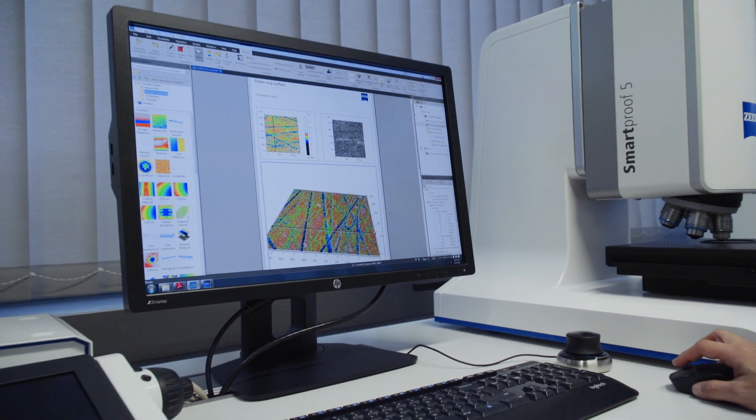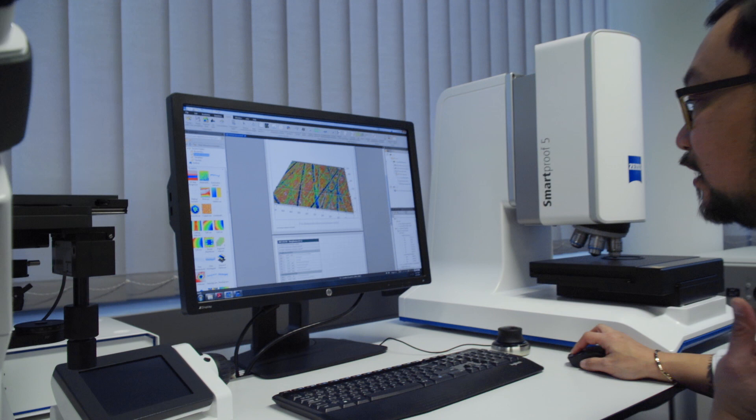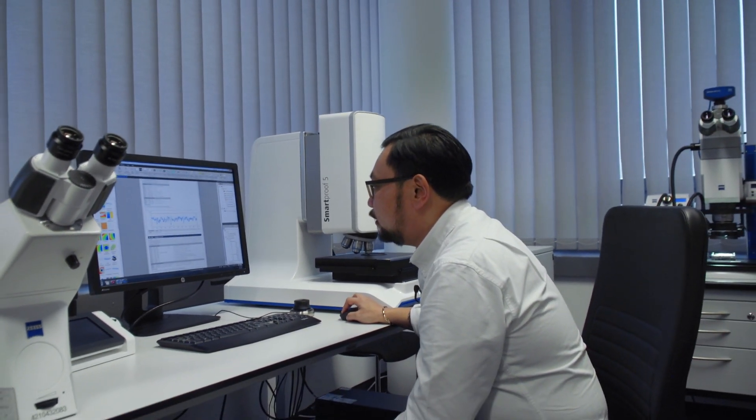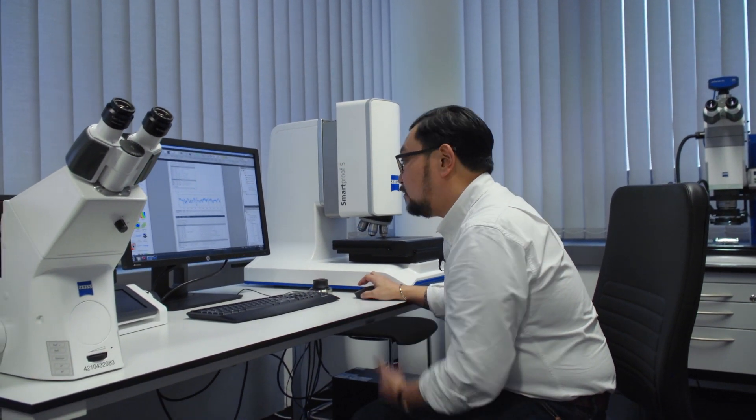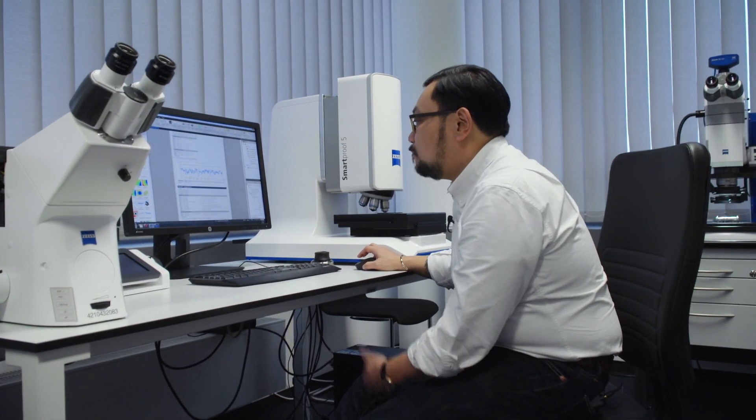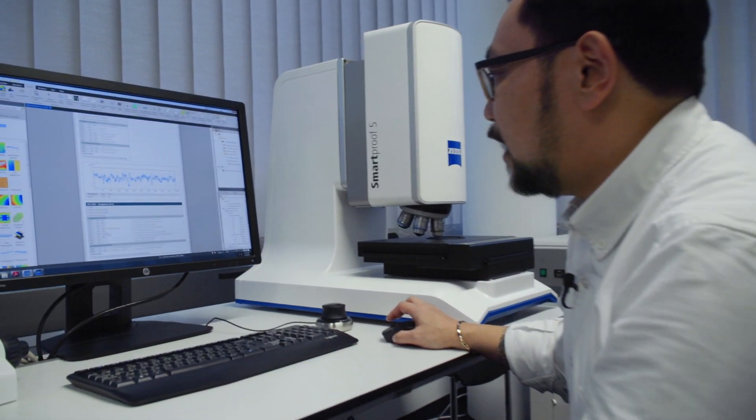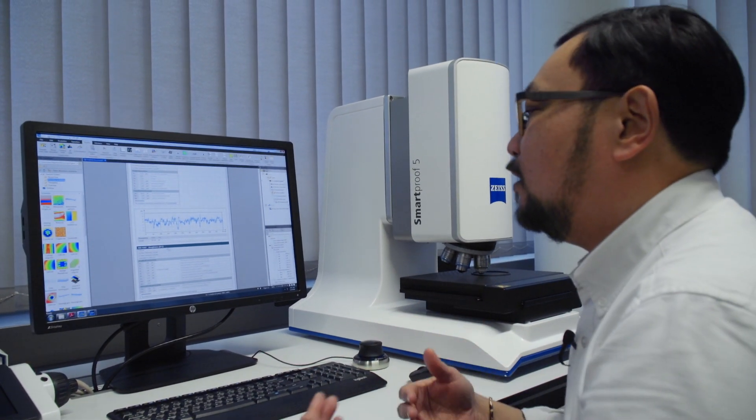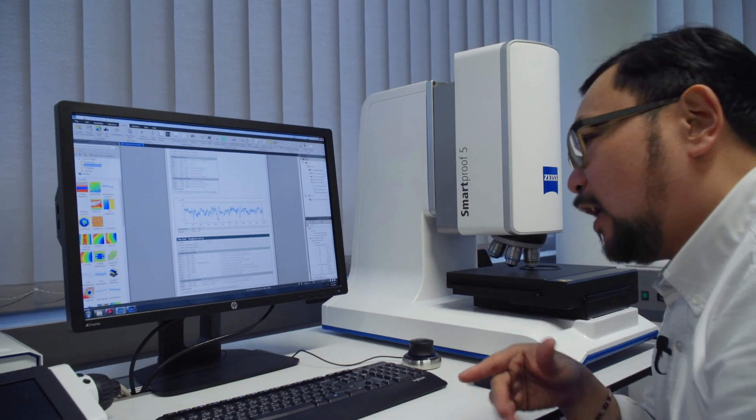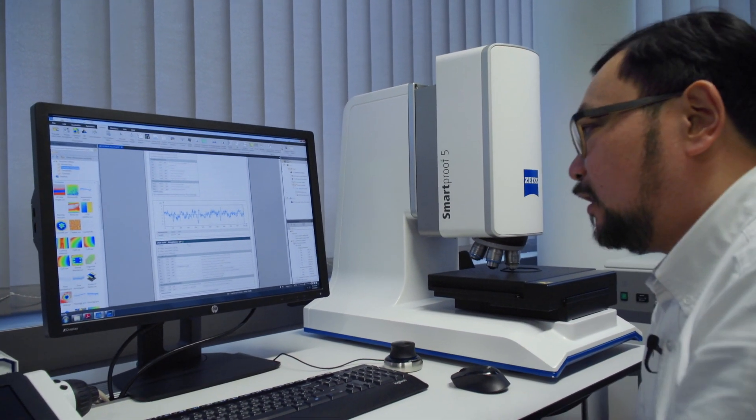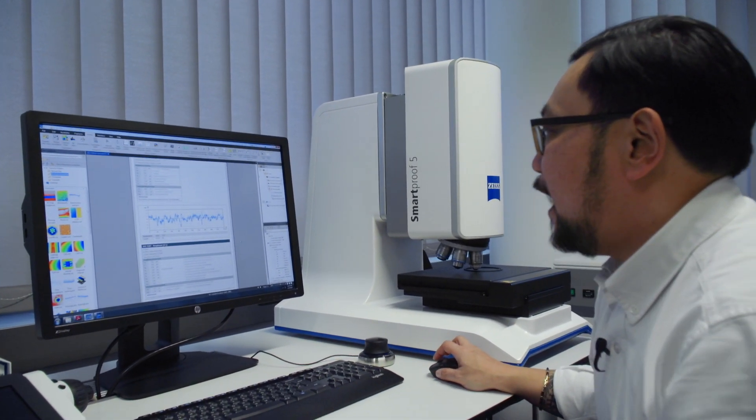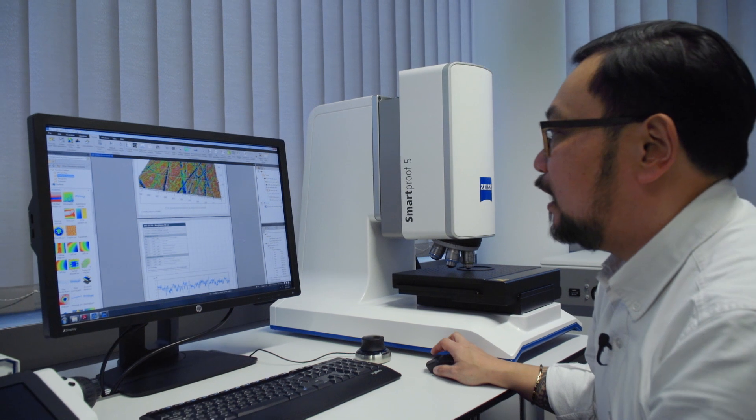And then of course as you're aware my initial customer wanted to see and analyze surface roughness so we can pull an RA value. This particular sample has an RA value of about 0.59 microns easily pullable from the data, and in addition to an RA we can get an SA which is the same value except across an entire patch not just a single line. As you can see here the reporting function is quite robust and definitely able to get our customer what they needed.